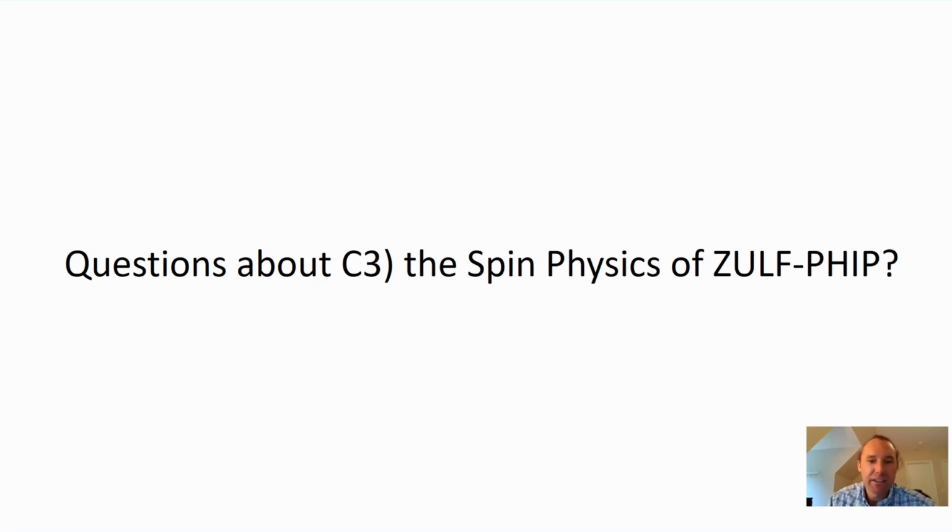Sure, yeah, it should be minus, I think. Usually the way it gets represented is something like a quarter identity minus I1 dot I2. But all you're doing is multiplying by a constant, which doesn't fundamentally affect the results of your simulations.